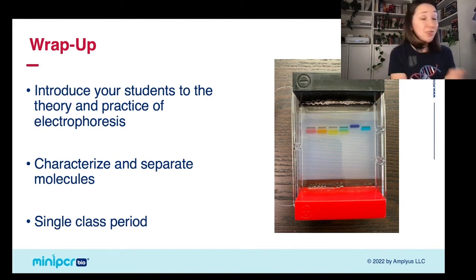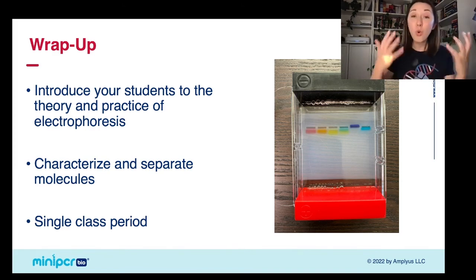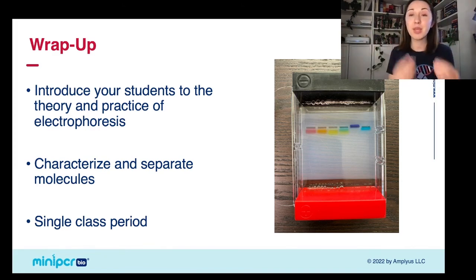But even right here, they did real science. They characterized and separated molecules. They were able to use a biotech tool to separate some molecules and learn something about them. And again, we were able to do this pretty quickly. You can do this entire lab in a single class period, or you can break it down even farther and have them assemble the Bandit as well. If you want to learn more about that, we had a webinar on that last week presented by Katie, and we'll have links to that below as well as on our YouTube channel.